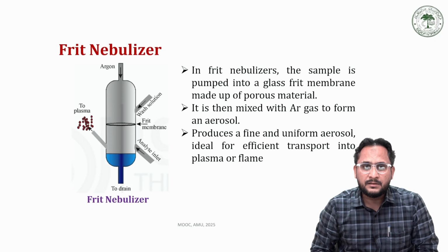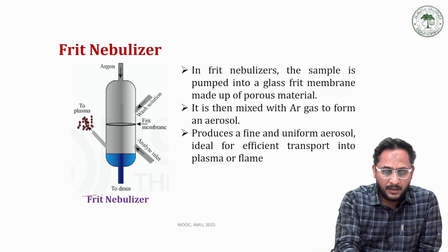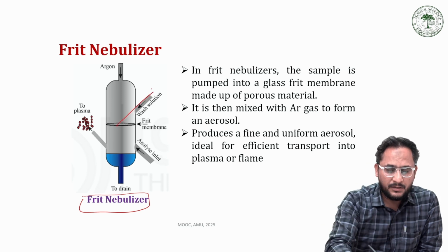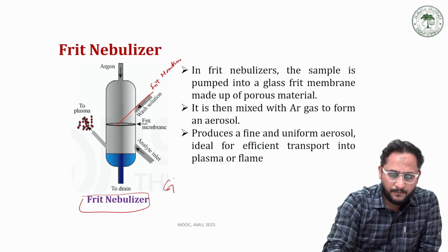This is a third type of nebulizer which we have not discussed previously when we were discussing the types of nebulizers in atomic emission spectroscopy. These nebulizers basically work on the principle of Frit membrane. Frit membranes are glass membranes, and they are quite porous as well.